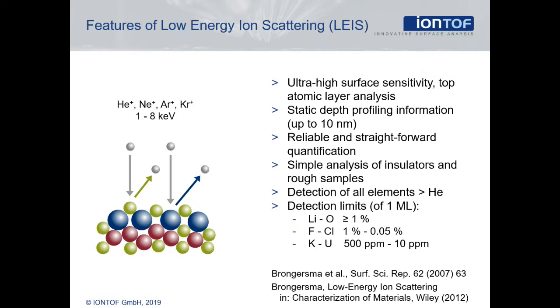Also, information on the composition of the first few nanometers of the sample is gained from the so-called in-depth information, which is contained in the spectrum and does not require any sputtering. There are, however, cases where additional depth profiling is required.